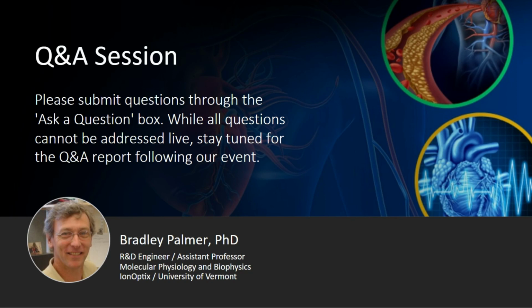The next couple questions are related, so I'm going to put them together. Obviously, you talked today about rat hearts. Somebody asks whether it's feasible to use mouse hearts, what the technical limitations of that would be, and how young could those mice be to be able to use those hearts?